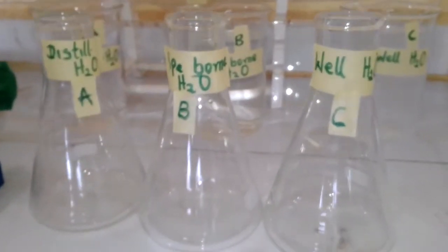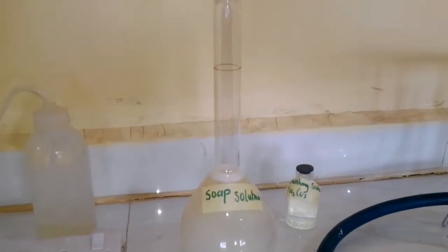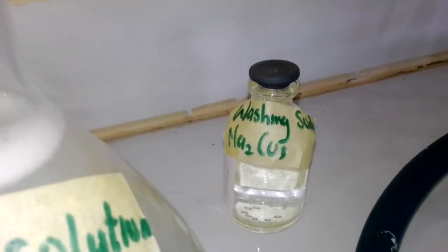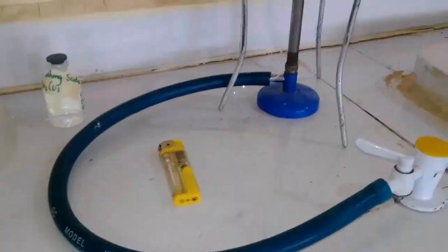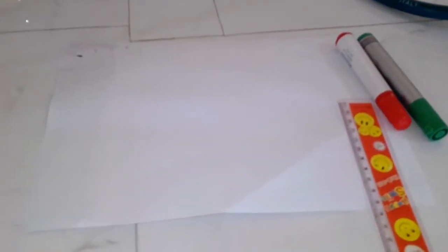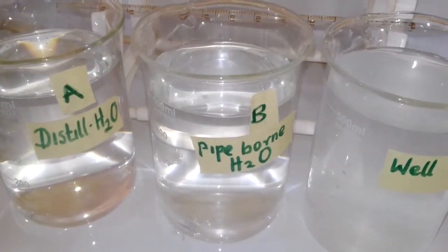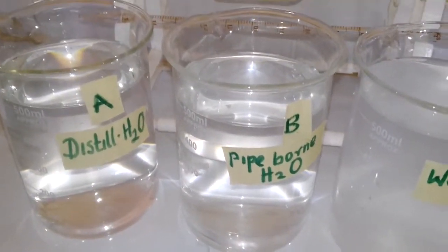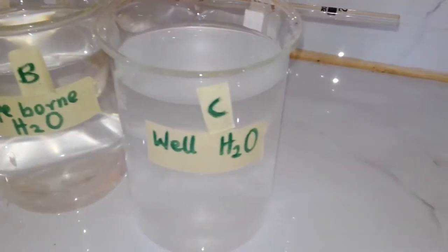the conical flasks, our pipettes, the wash bottle, our soap solution, washing soda, our Bunsen burner and lighter, our writing materials, our water samples, which are A. Distilled water, B. Pipe-borne water, and C. Well water.